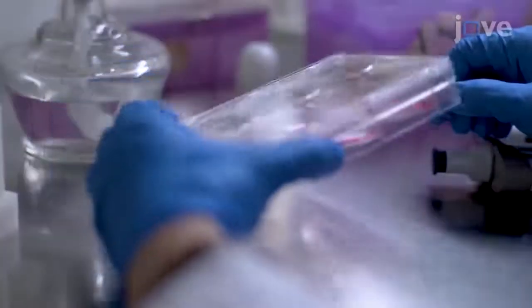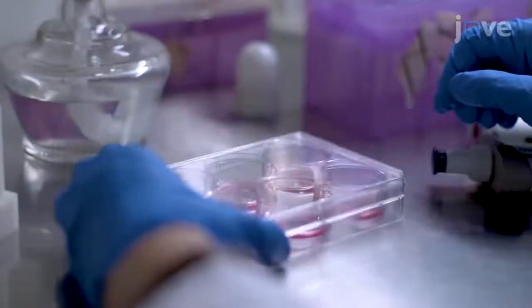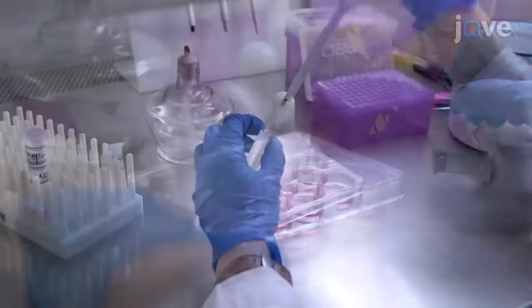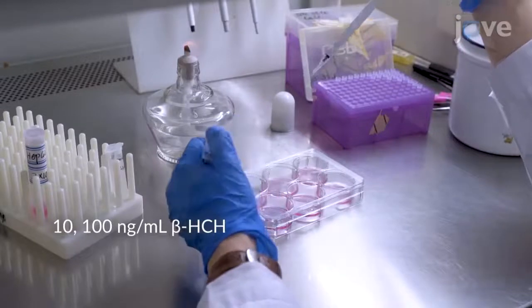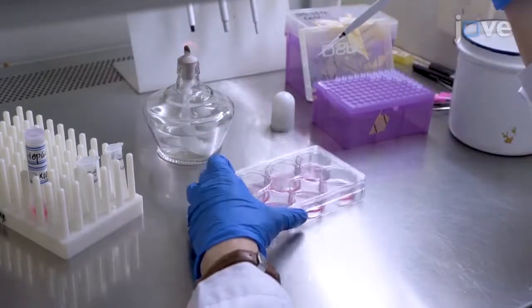To evaluate levels of cellular ATP, seed 20,000 HepG2 cells in 6 well plates. Add beta-HCH and incubate at 37 degrees.